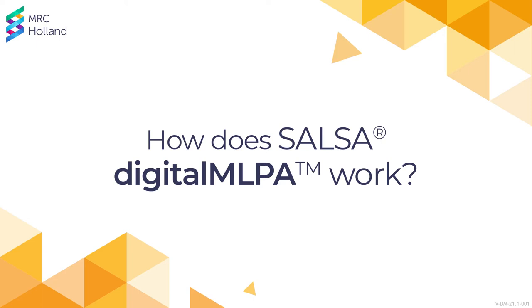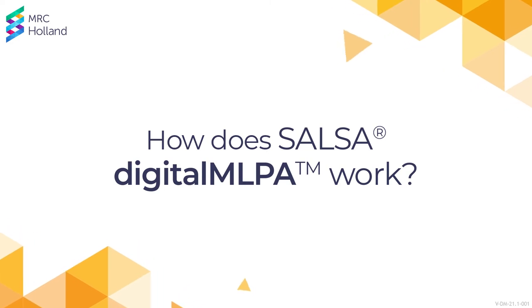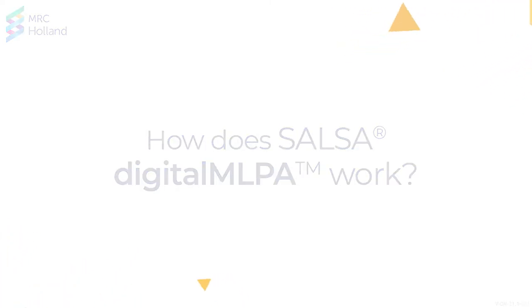How does SALSA digital MLPA work? The SALSA digital MLPA method consists of the following steps.